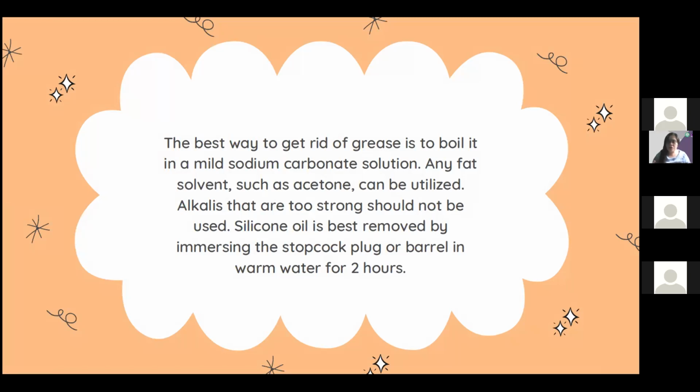But if it cannot really be removed using soap, then we can use chemicals like our acetone. Our basic substances, when you say basic, mga alkaline substances natin. Hindi talaga necessary gamitin yung mga strong ones like yung mga sodium hydroxide. Very strong na yun for our laboratory wares. So, we can use the alkaline ones pero yung mga hindi masyadong strong na.